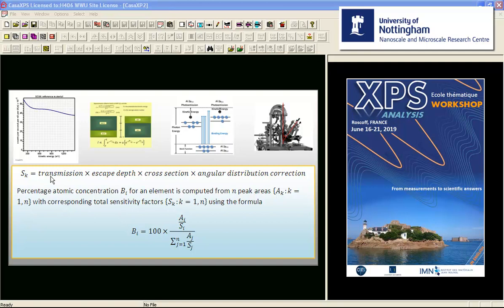They provide an element library that represents a set of total sensitivity factors. These sensitivity factors were measured on a specific instrument for which the response as a function of kinetic energy is known. The response of any new instrument is then measured, and a relative transmission function is calculated and included with spectra.